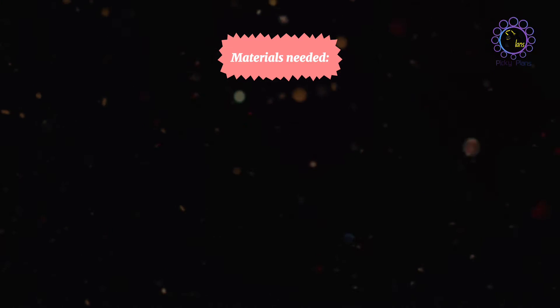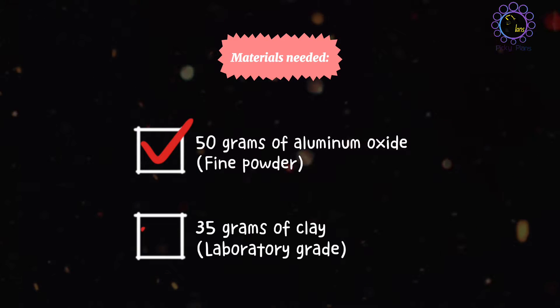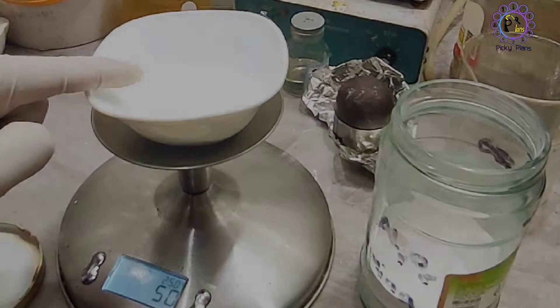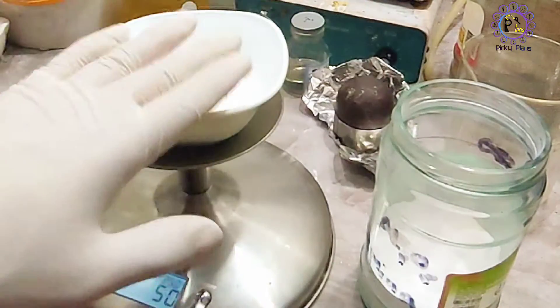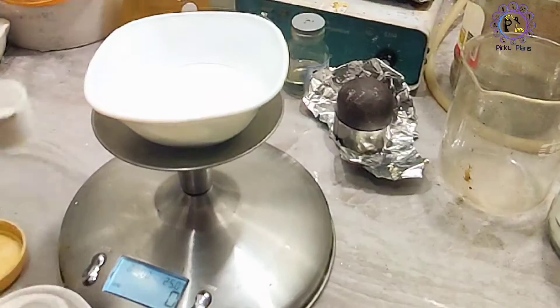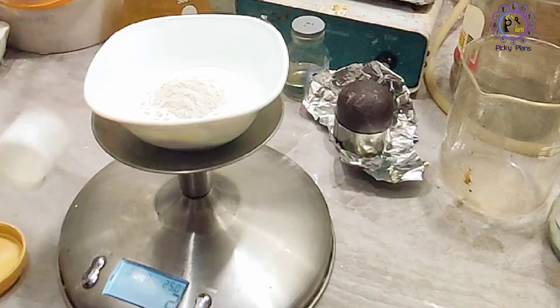Materials needed: 50 grams of aluminum oxide and 35 grams of clay. I added 50 grams of aluminum oxide to the dish, and now I want to weigh the clay — 35 grams of clay.